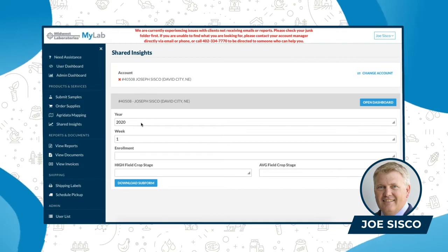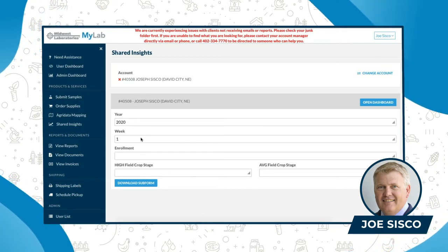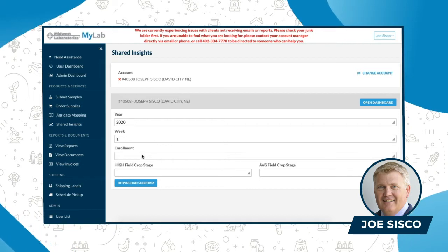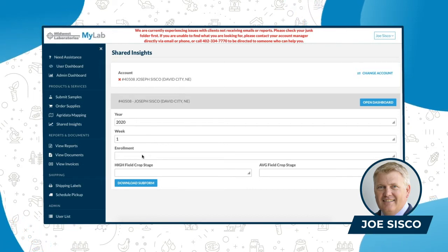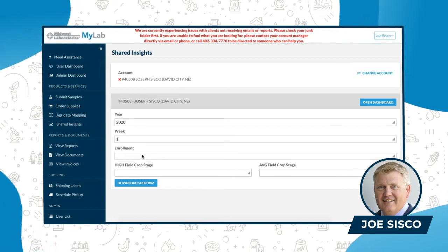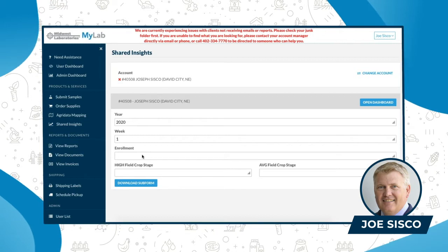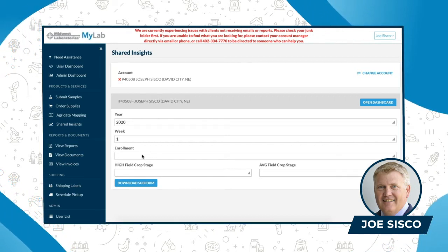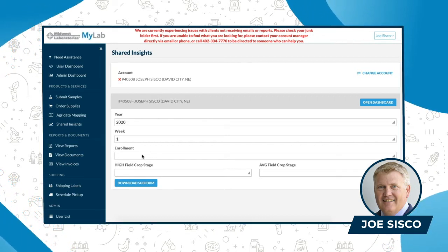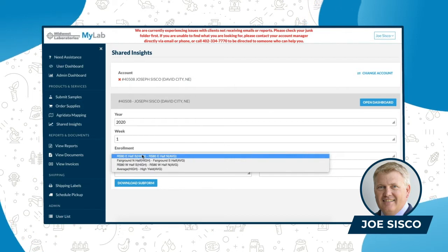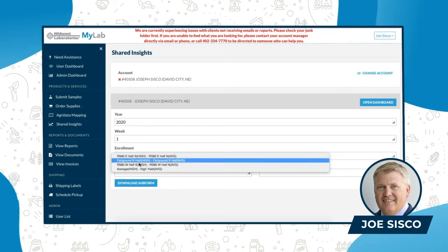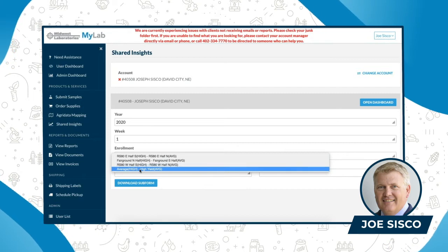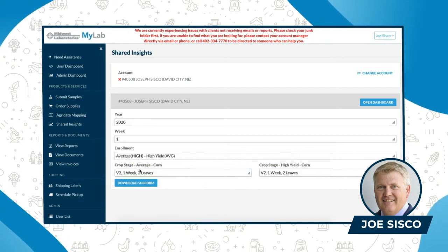The year is 2020. The week that we're going to submit right now is week one. The enrollment is for the number of fields you might have — if you have four or five fields, you're going to have four or five different enrollments. In my case I have four fields, and today I'm going to go after my average and my high yield field, so I click on that.